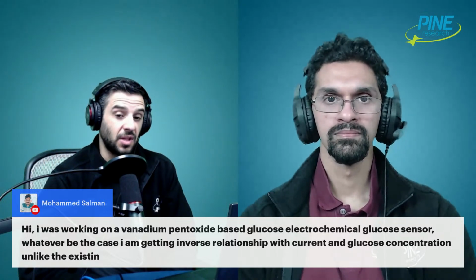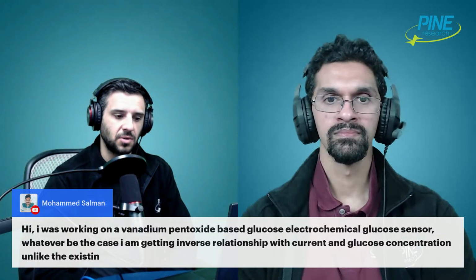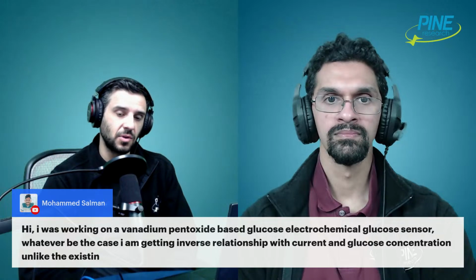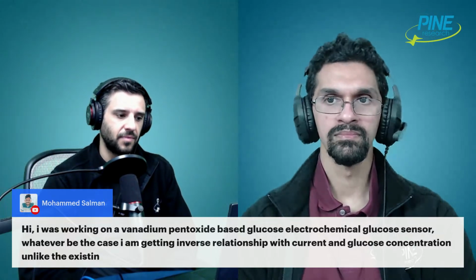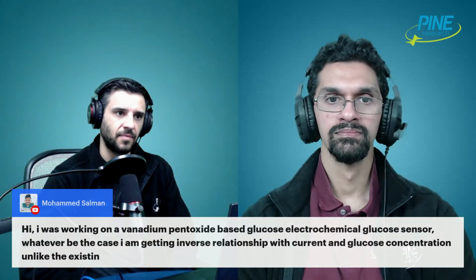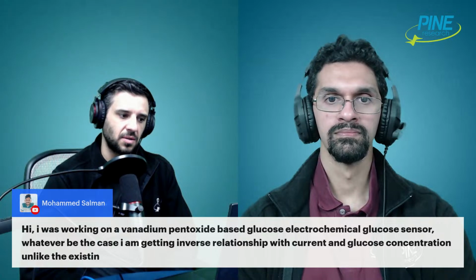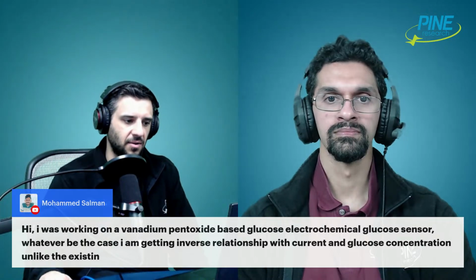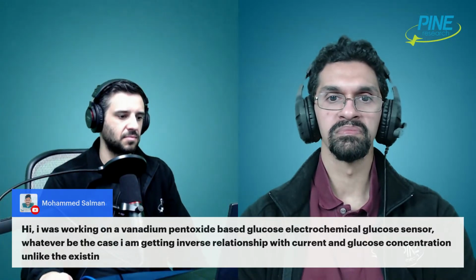And then, what kind of electrochemistry are you doing? Are you just doing controlled potential, controlled current, or maybe a pulse technique would be useful if you're looking for a peak, or however the detection works. If it's just a straight voltammogram or a set potential, and then you measure the decayed current after a while. There are a lot of follow-up questions I have, but those are just a few things I can think of. I don't know if you want to say anything about it, Ian.